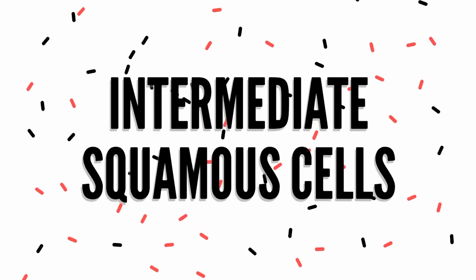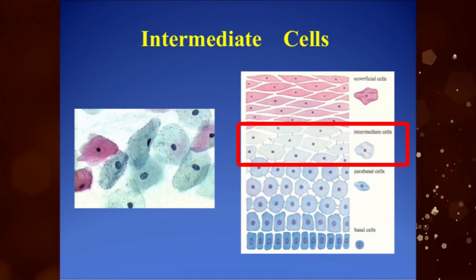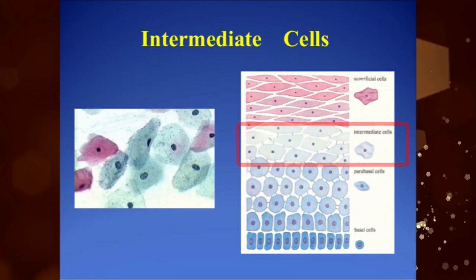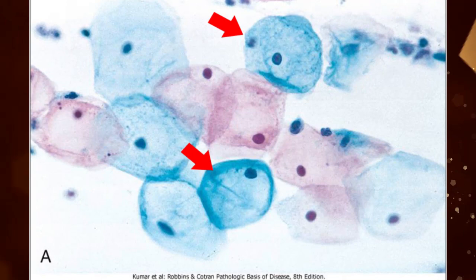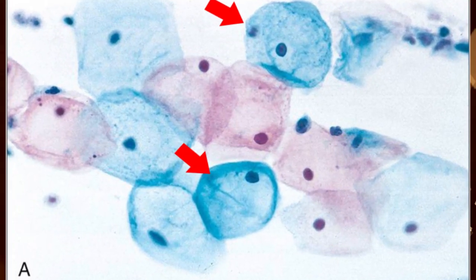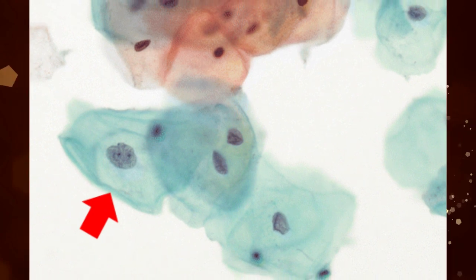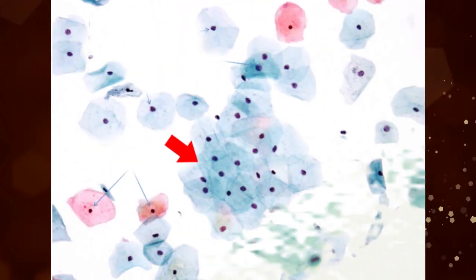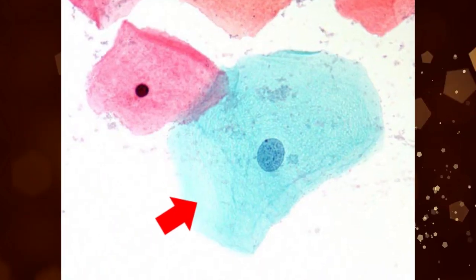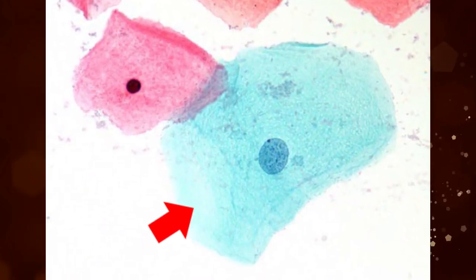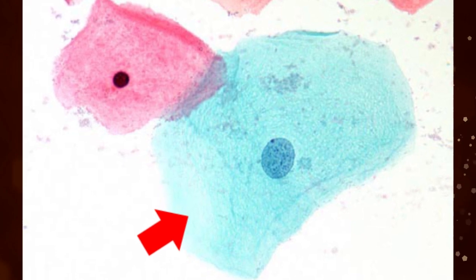Intermediate Squamous Cells are found in the stratum spongiosum layer of the squamous epithelium. These cells are large polygonal shaped, 30 to 60 micrometers in diameter. Intermediate cells occur singly or in sheets. Nuclei are centrally placed and get a round or oval shape. Also, fine granular chromatin can be seen.